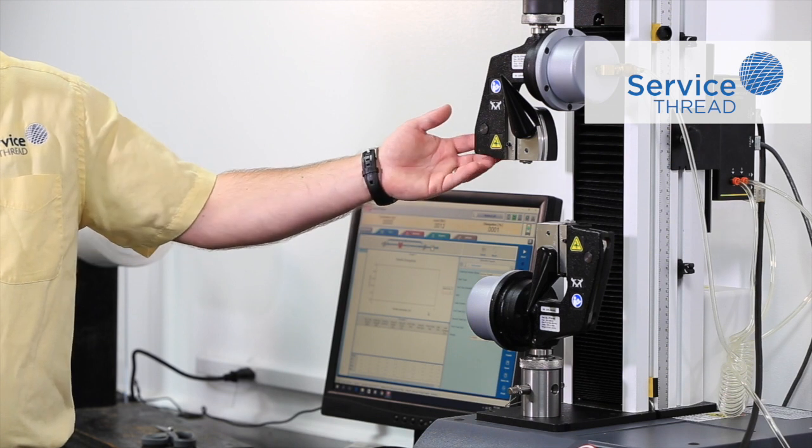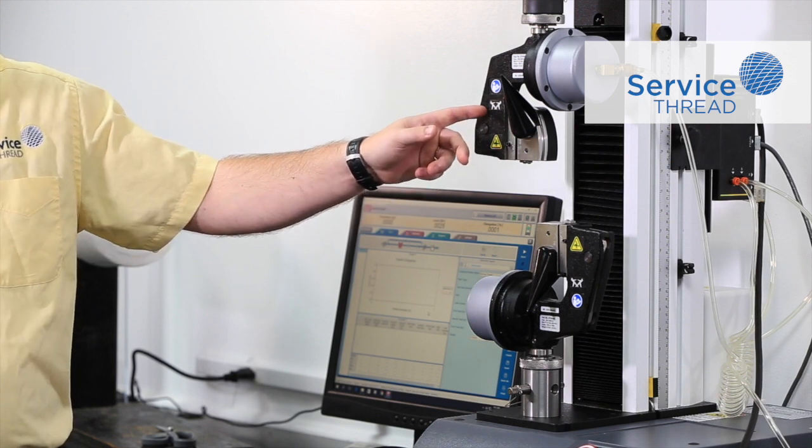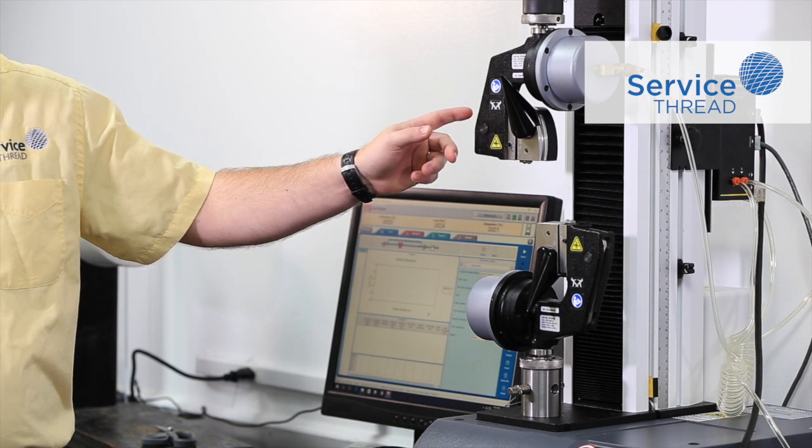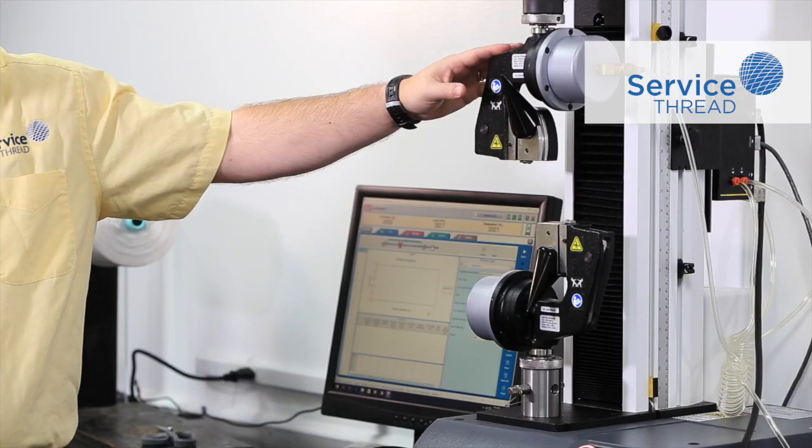For this particular test, we're using the INSTRON 3345 constant rate of extension tensile tester. The grips that we're using are pneumatic yarn grips that are rounded at the top to prevent jaw breaks during the test process. The grips themselves are rated at 450 pounds, so we can do anywhere from a small polyester fiber to a heavy aramid fiber.